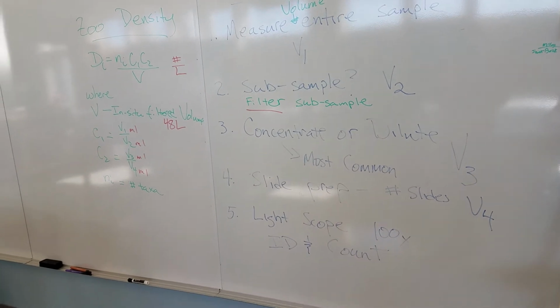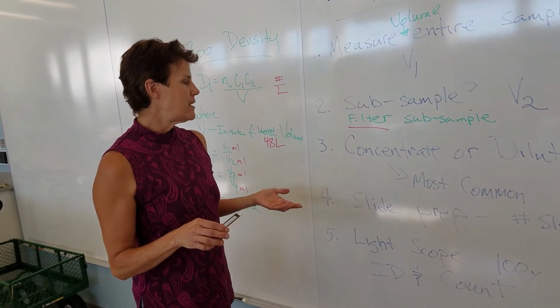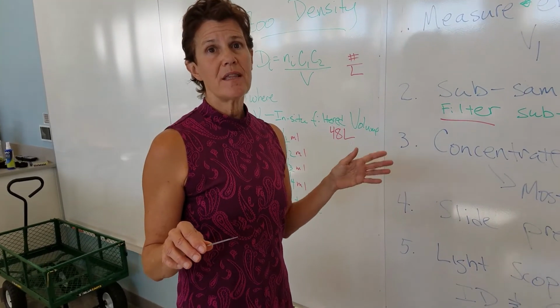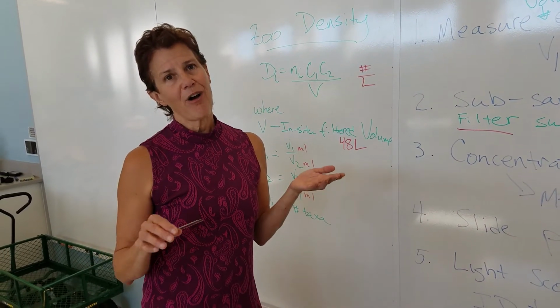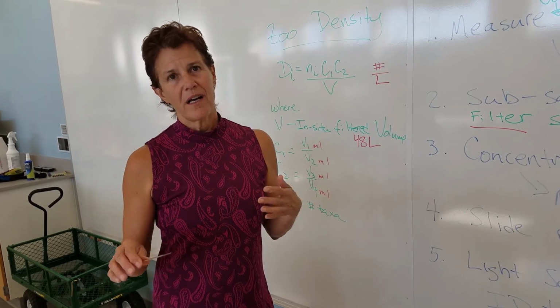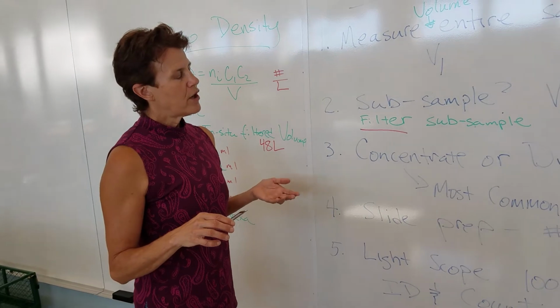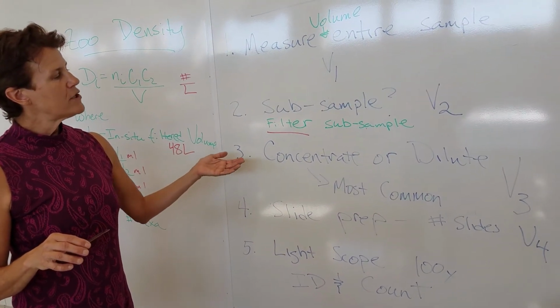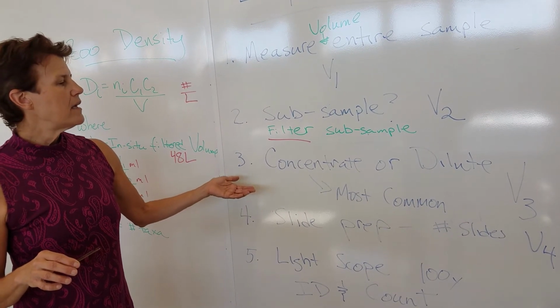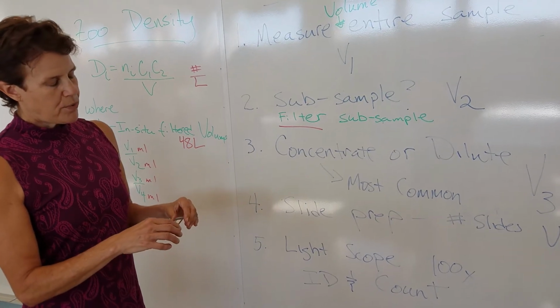So then we do slide prep. If I have 3 students, or if there are 4 students in the group that's sampling, and everybody, by the way, gets to do this, not just the freshwater tidal or lake people. So everybody gets to try their hand at doing zooplankton processing. So next we'll move into putting our sample onto a slide. So this concentrated sample is put into a small beaker, then we use a disposable pipette to prepare a slide.